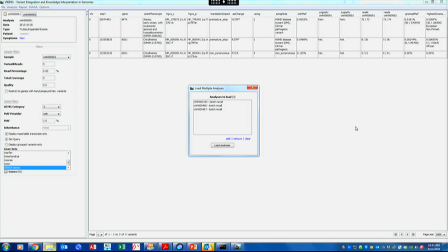For your cases that you're going to do this afternoon, we pre-created gene lists for you using those terms because it's a little wonky for you to do it separately, but we're going to show you how you can do this using this other tool. It's much easier to use than the terms we've been showing you. It's searchable and has tree logic and is less boring. So we'll show you that.